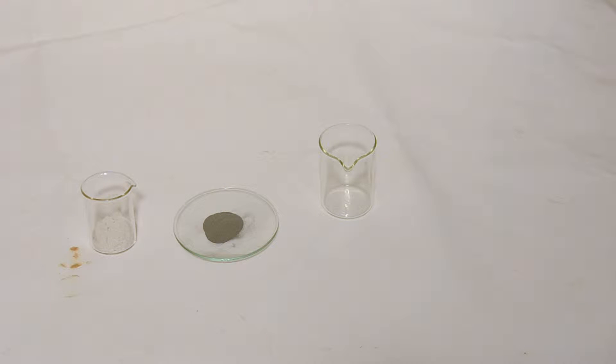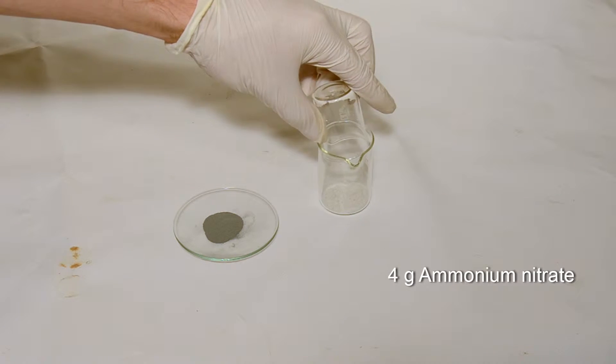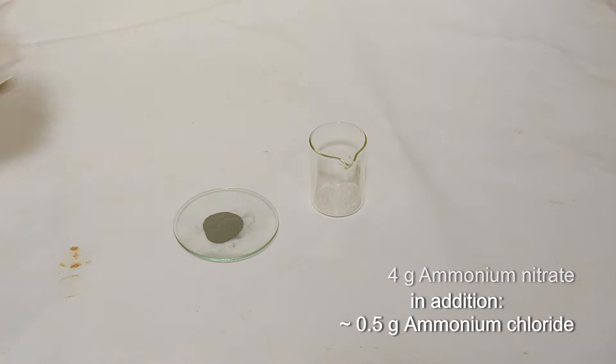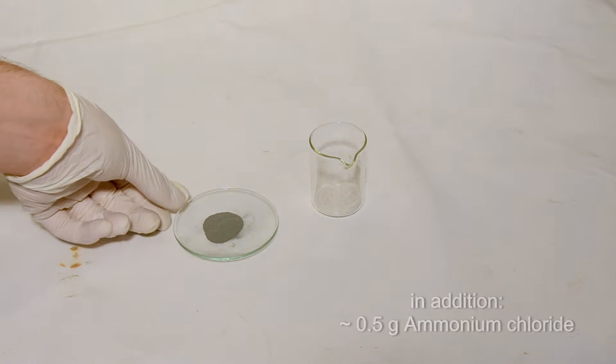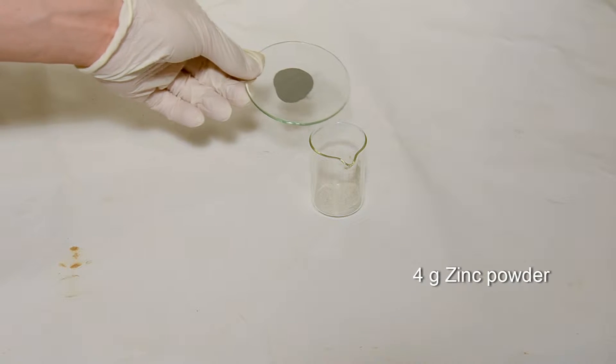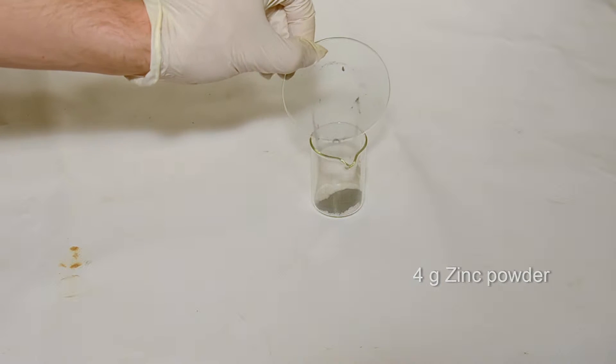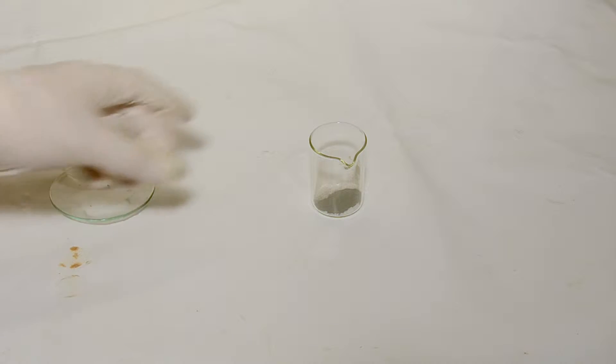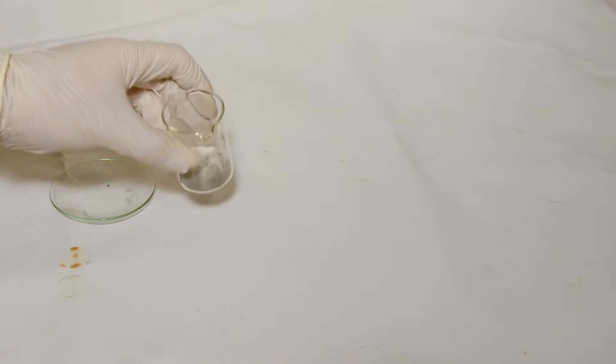Here you can see the first mixture we are using. For that, we need 4 grams of ammonium nitrate with half a gram of ammonium chloride mixed in it, and we add to that the equal amount of zinc powder. Then we mix them both together by shaking the beaker a little bit.